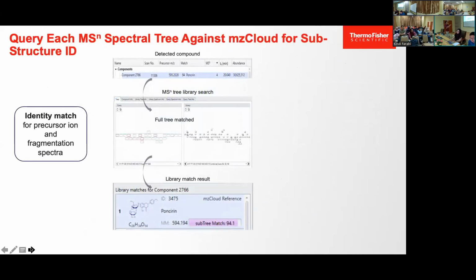Okay, so this is a bit more detailed. For a specific component, you can have the 3 matches, and then it will come up with a particular structure, chemical formula, and it always has a percentage. For all software, it won't tell you that it's 100%. It will have a certain variation because of uncertainty. So it will tell you that maybe it's 95% confident. The rest of the 5% is really dependent on the experience of the operator or the chemist to look through the data, check the chromatography result, and make sure that it is correct.